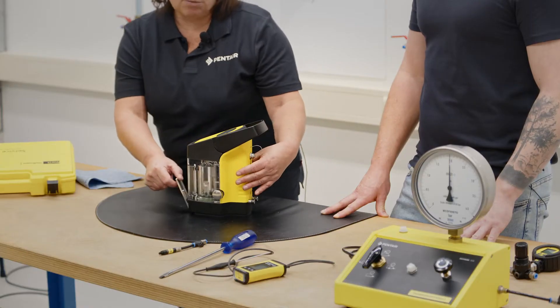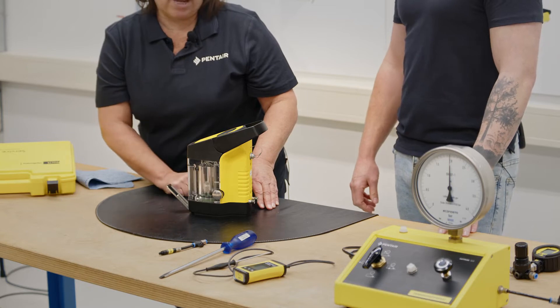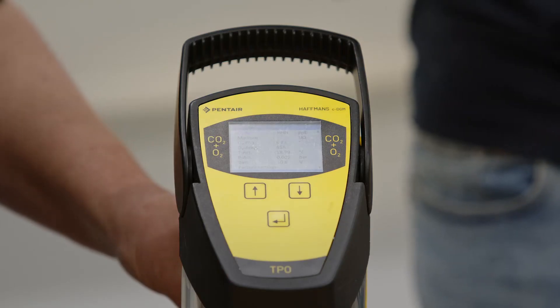When opening the plunger, you can read if the meter already measures approximately zero bar.